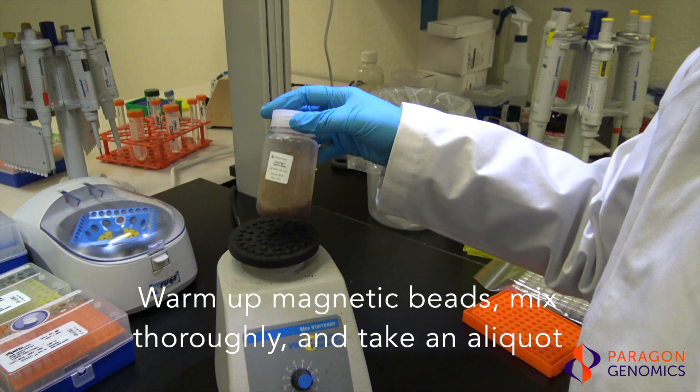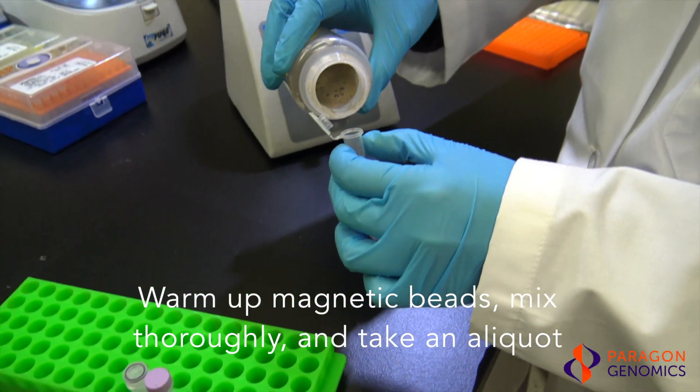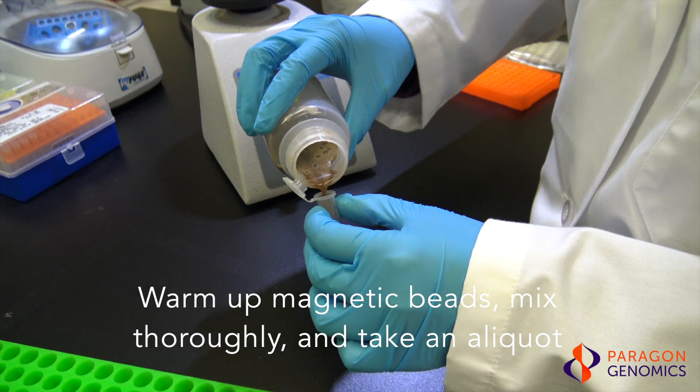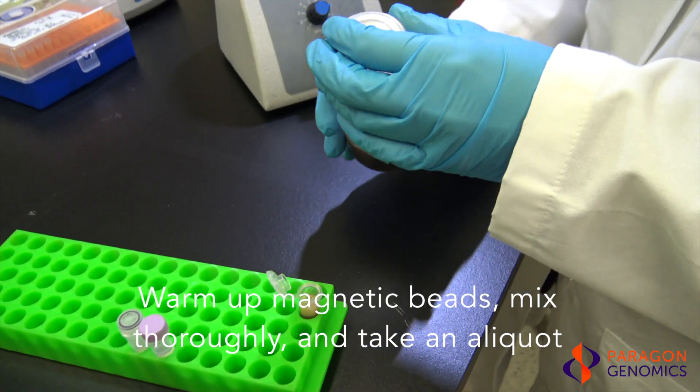Always thoroughly vortex and mix the bulk solution prior to dispensing. Take a small aliquot of the magnetic beads from the bulk solution for use in the CleanPlex protocol. Doing so helps to prevent contamination of the bulk solution.